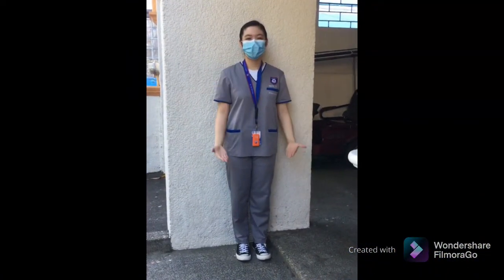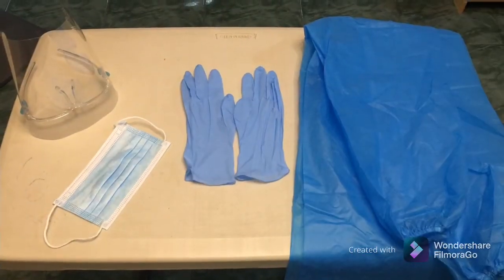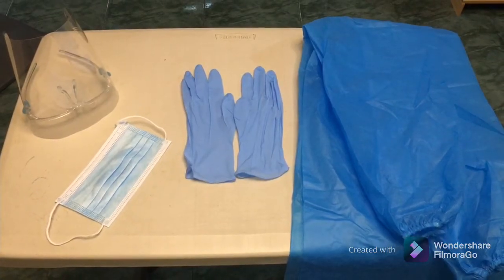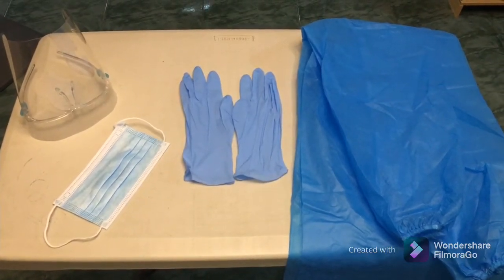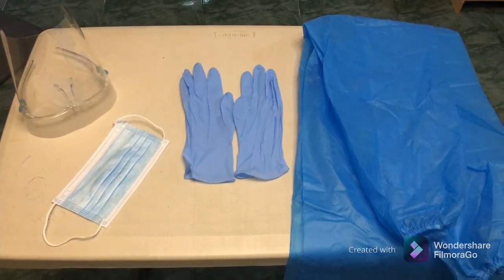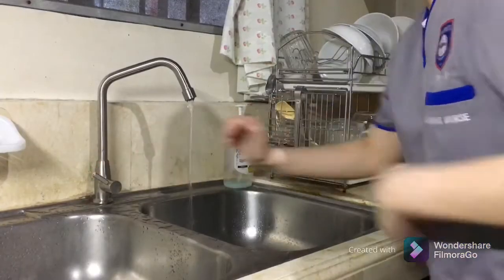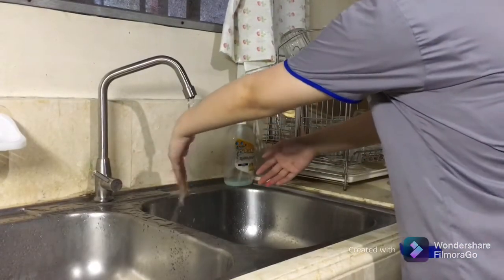Here is my complete uniform. Assemble all necessary equipment: clean gown, clean gloves, face mask, and face shield or goggles.